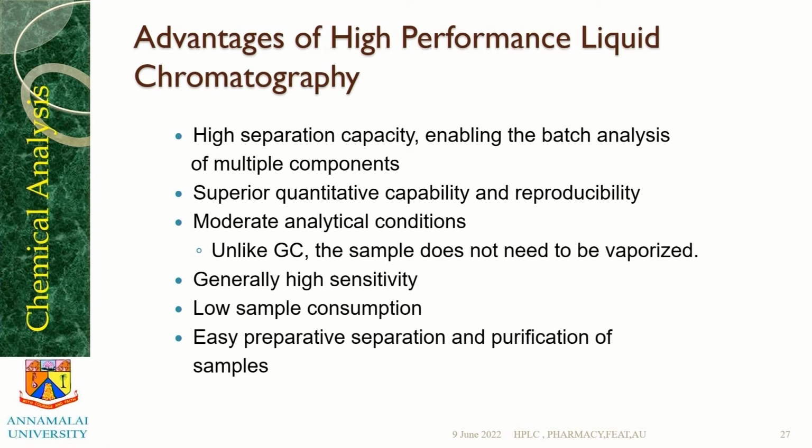Low sample consumption. If a microgram or nanogram level of sample is present, we can easily use it for analysis in the HPLC. Easy preparative separation and purification of samples.